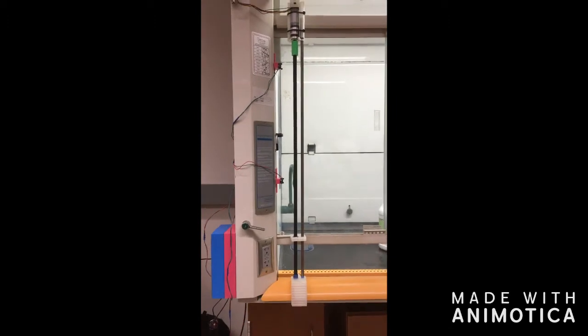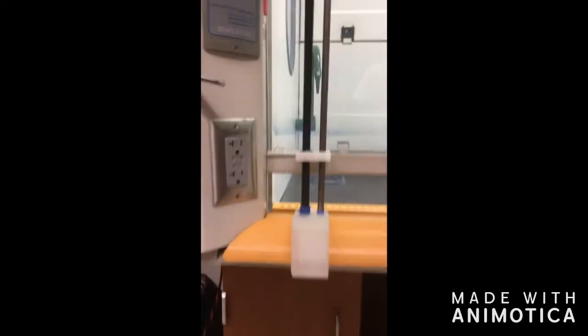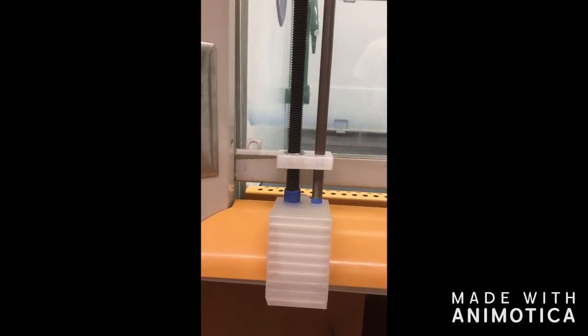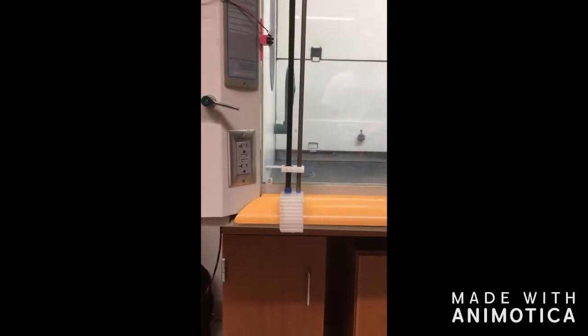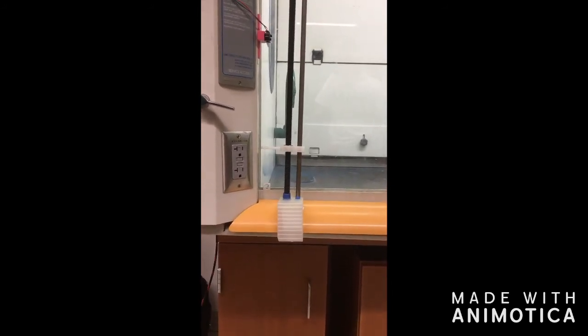The device satisfied the criteria of being out of the user's way, but failed the criteria of not significantly worsening the user experience. Our device partially or completely met all the design criteria. The prototype demonstrates that our ideas work, but it has not matured enough to install on actual client fume hoods due to limitations on testing accessibility and attachment.